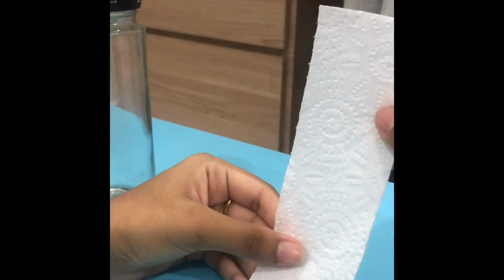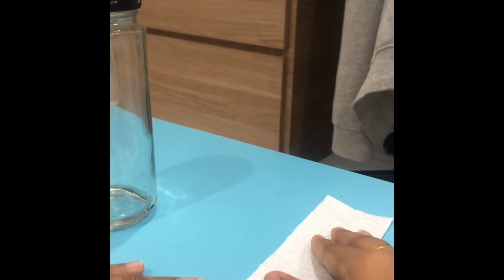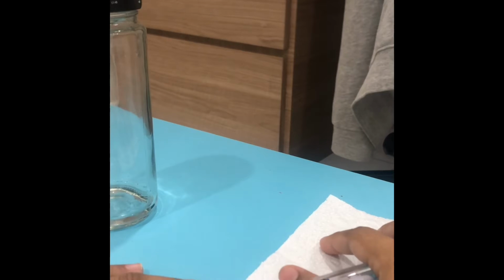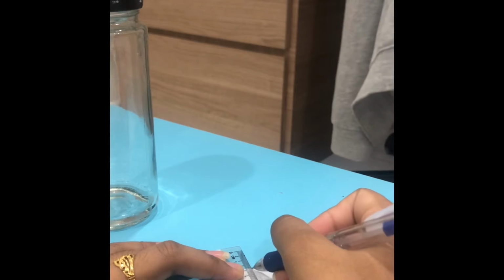So now on to the marking of the plate. First you have to measure about 1 cm from the bottom of the plate, and I'm going to use exactly 1 centimeter. You have to be very gentle when you're marking this, because it's a paper towel and it can tend to tear.